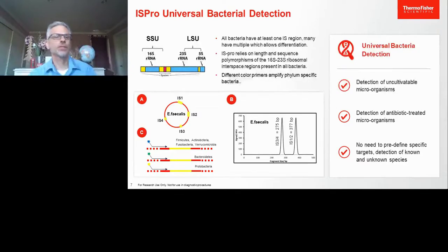So our colleagues at InBiome have used this approach to examine microbiota in nasopharyngeal swabs collected from individuals that have been infected with SARS-CoV-2. And they have used this technique to identify specific microbiota profiles that may be correlated to the likelihood of infection of the virus.